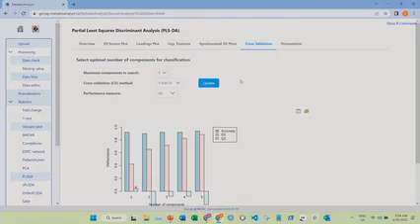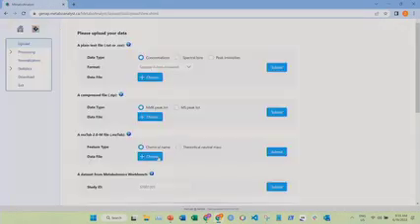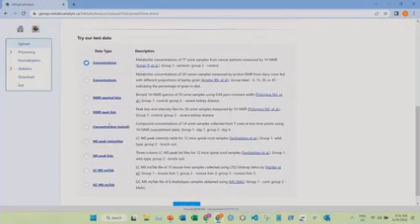Okay, that's all that I have for the demo. If you go back to the home page and you go to this statistical analysis 1 factor, there are many different example data sets. So here's where it's your opportunity to go there, select different ones, try and go through the analyses, and then if you have any questions, we'll move around and answer. So especially if you've used MetaboAnalyst before and you have some things you're not sure about, now's the time to ask and we'll come help.